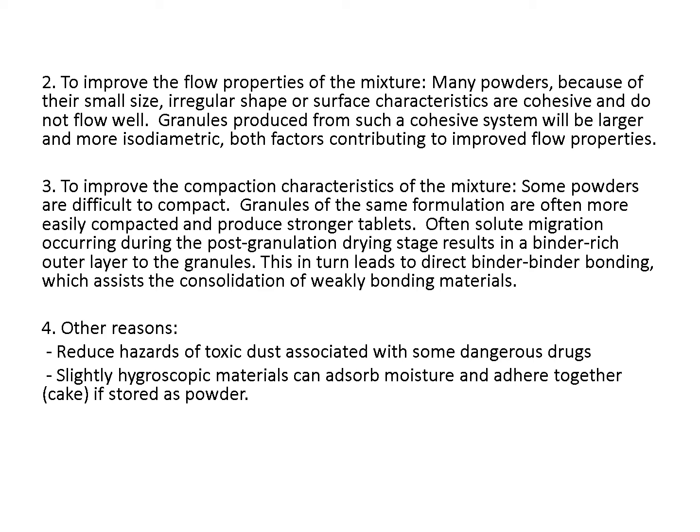Drying will make water inside these granules move from the inside to the outer layer and leave the binder powder as a layer around the granules. When we gather these granules, a new, stronger bond will be formed between the binder bonds available in the outer layer of the granules, and that makes it more compacted. It assists consolidation for weakly bonding materials.